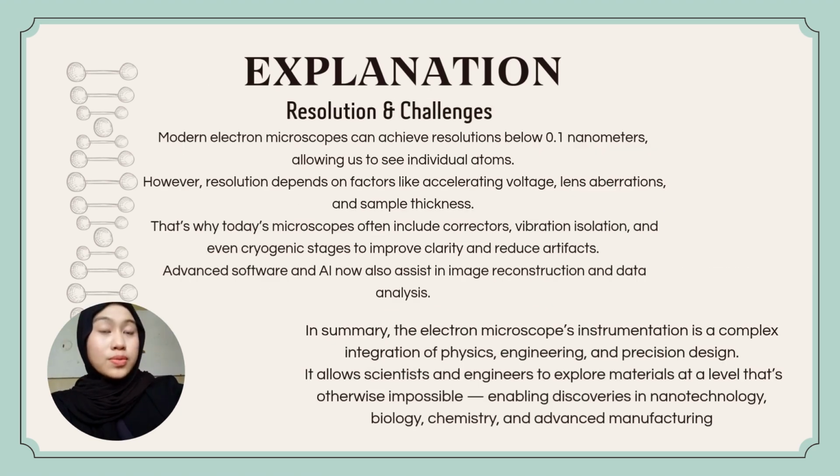Modern electron microscopes can achieve resolutions below 0.1 nanometers, allowing us to see individual atoms. However, resolution depends on factors like accelerating voltage, lens aberrations, and sample thickness. That's why today's microscopes often include correctors, vibration isolation, and even cryogenic stages to improve clarity and reduce artifacts. Advanced software and AI now also assist in image reconstruction and data analysis.